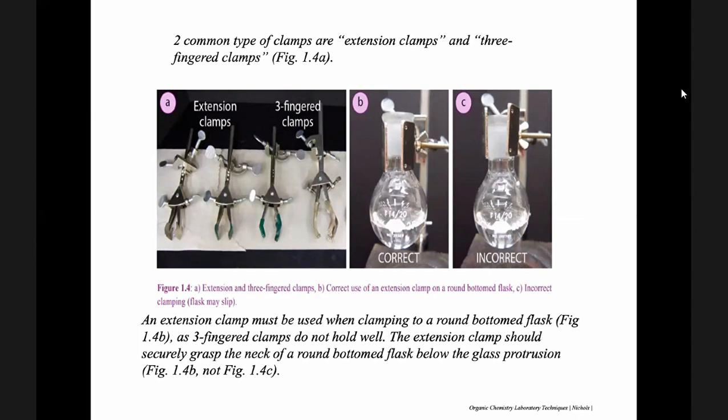Okay, so these are, as I have said, extension clamps. This one is the three-fingered. And this is how to correctly mount an extension clamp. It should grip properly, and it cannot be allowed to lock out.